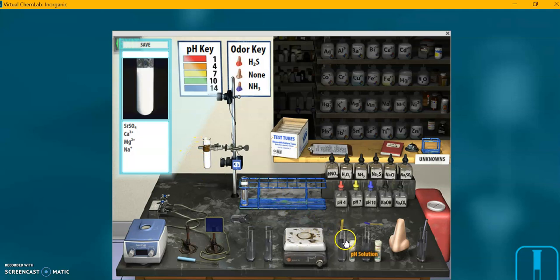By the way, you can click on that pH solution. That little piece of paper there shows at the bottom there that it looks like it's pH 4. And white solution. Strontium sulfate has precipitated out at that pH.